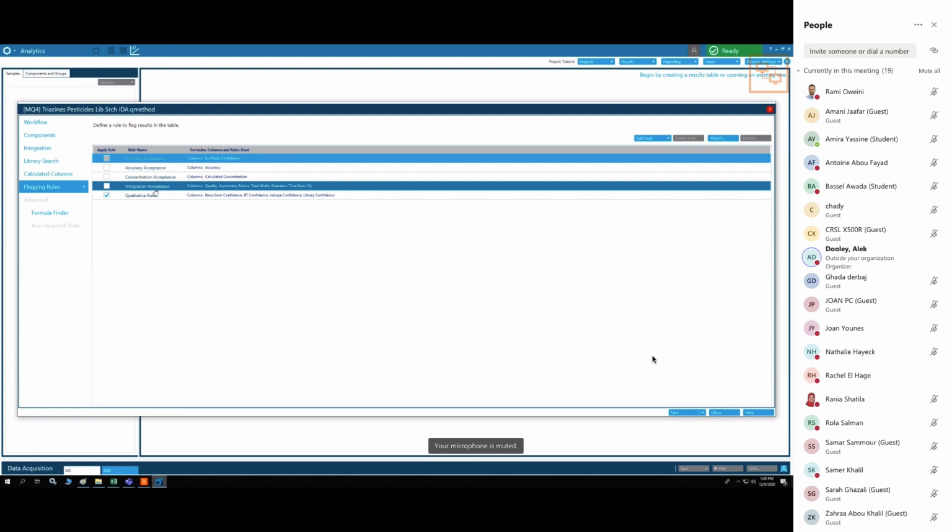As far as I understand, you are not so interested in quantitation. Maybe I'm wrong there, but we can easily do some quantitation at some point. In LCMS, quantitation works with an external calibrant, so you would need to use your standard to prepare your standard curve.